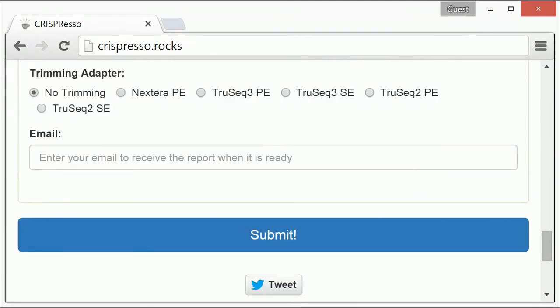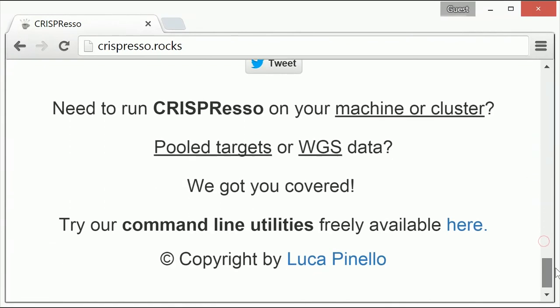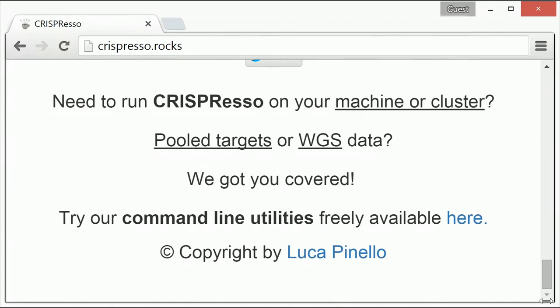This concludes the tutorial of the CRISPResso web tool. A set of command line utilities, including CRISPResso, can also be downloaded via the link at the bottom of the page.